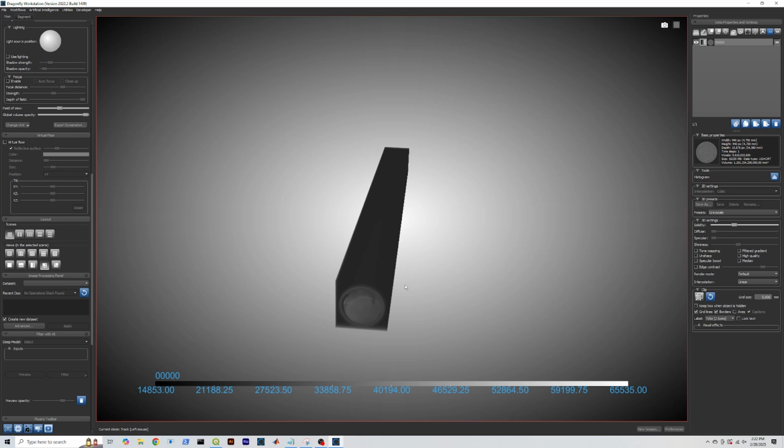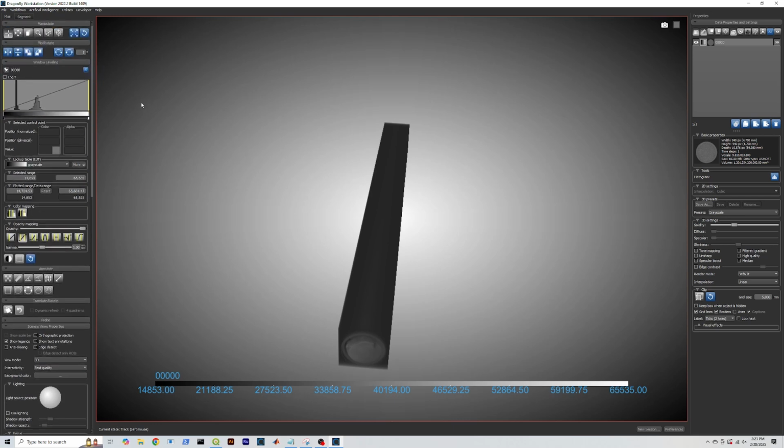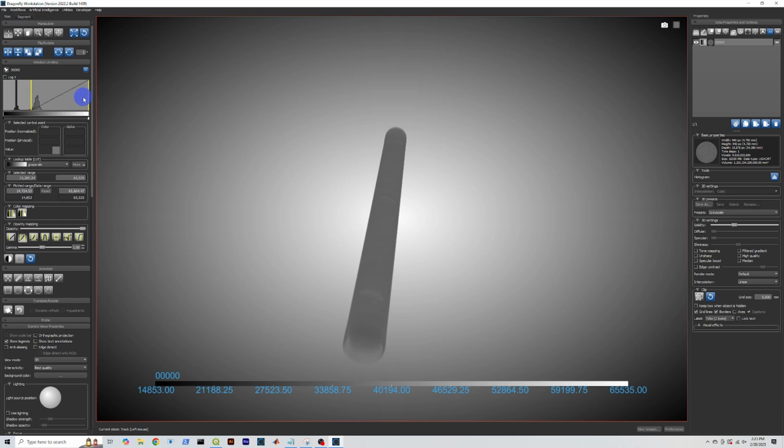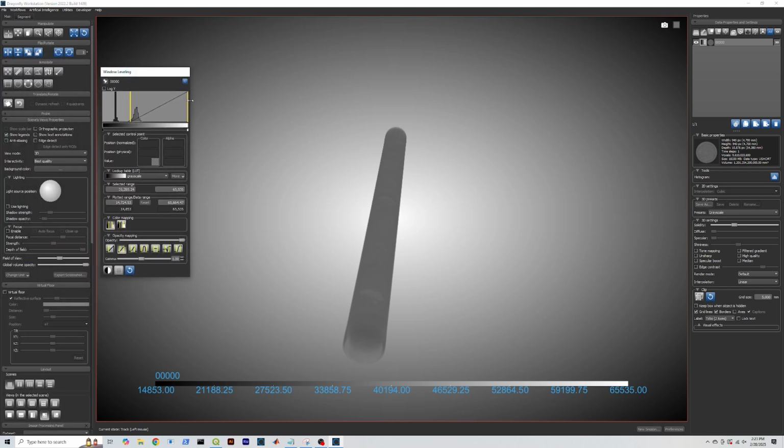As you can see, the air in this three-dimensional volume is opaque, and so you don't see any portion of the core itself, and you can change that by using your window leveling tool. So, oopsie, I just popped that window out, annoying. And so now we're going to zoom in on just that region. You can see, oh, there's all the debris in this core. Wow.